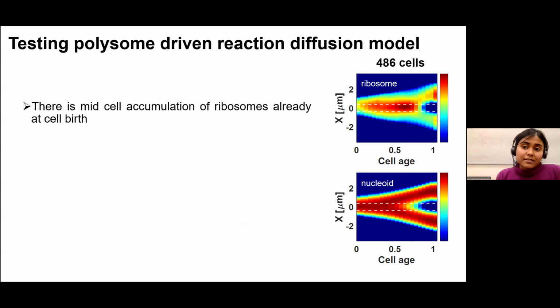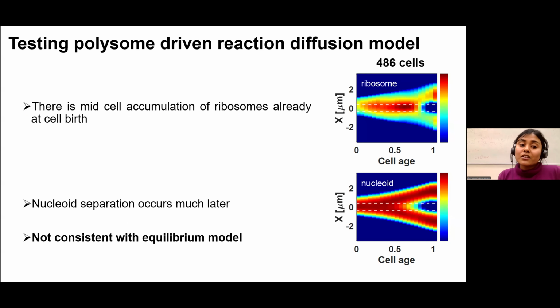So what we see is that there is an accumulation of ribosomes. We can observe it at cell center. However, it is observed throughout the cell cycle, and it starts at the beginning of the cell cycle itself. And the nucleoid separation occurs much later. And this is not consistent with the equilibrium model because this shows that ribosomes are not 100% excluded from the nucleoid region. And due to the co-localization of ribosomes and nucleoids at cell center, at least in early cell cycle, we can't say that ribosomes drive nucleoids apart.